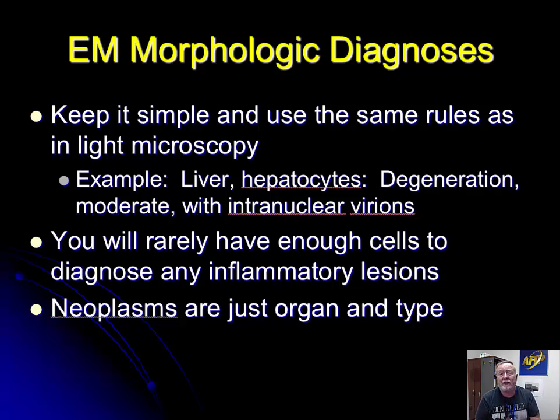Okay? A lot of the pictures I get, people have zoomed so far into the cytoplasm that everything becomes a bunch of little dots, and then they want to say, well, this looks like this dot in this article, this dot in that article. So make sure you have a range of pictures: far away, medium distance, and close, and not just zoom in. The other thing that people want to do is they want to try and overinterpret really bad tissue.